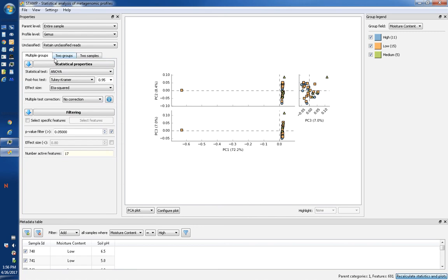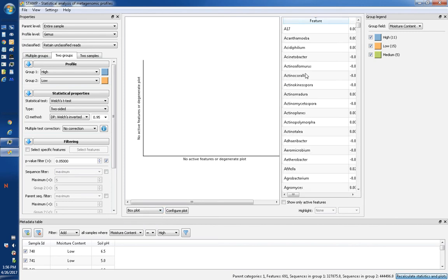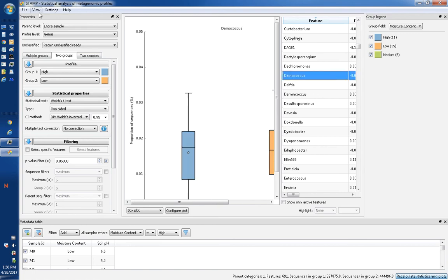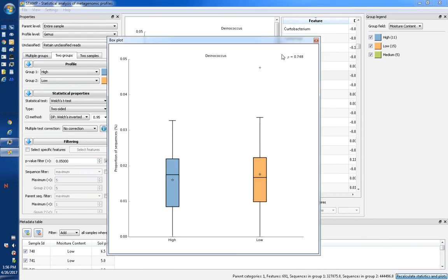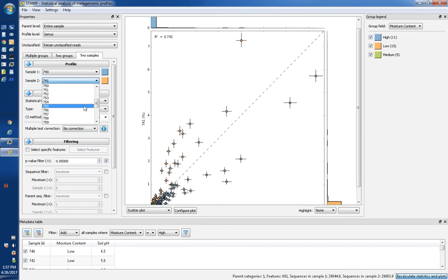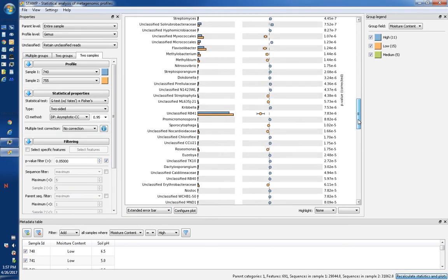Back towards the properties panel, you can use these tabs to switch over to different levels of statistical analysis. Towards the bottom of the main plot window, you can select different ways of visualizing your data according to the questions you might want to ask. Take this time not only to explore your data, but also to explore what ways you can present your data in a way that fits your research narrative. This video has only shown you the tip of the iceberg of what STAMP is capable of doing — generate cool graphs, but most importantly ask questions about the statistical significance and biological relevance of the work that you are doing.